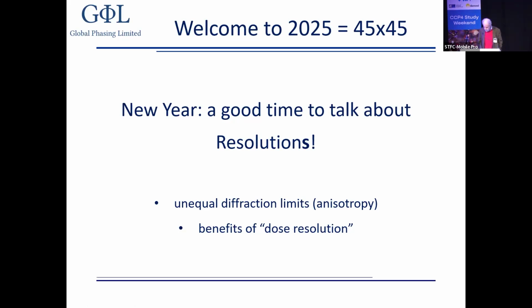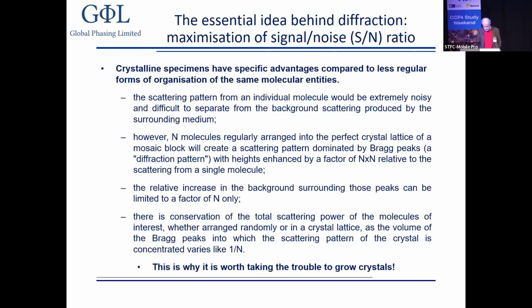So let me start by reminding you, you won't have time to read all this, but that we use crystals as a way of enhancing the signal to noise ratio in the scattering pattern.